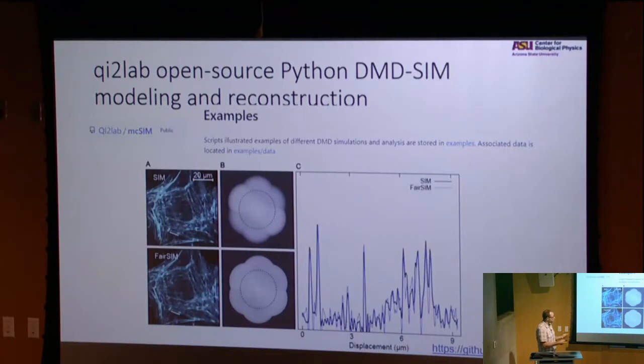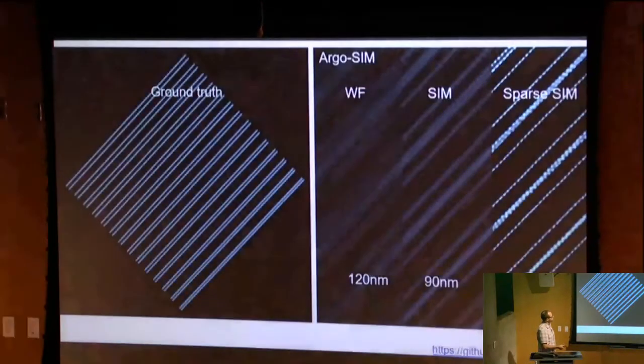If you're interested in this type of SIM, the super resolution SIM, we've compared it to other groups. It compares favorably. This is the exact same sample imaged with our instrument, compared with our algorithm versus another group's algorithm that doesn't know anything about our instrument. It just tries to estimate the parameters from the data. These are the resulting images, and these are the resulting reciprocal space. You can see there's a slight difference in the band re-weighting, but the actual line cut of the data that's taken here is almost identical. So we're pretty confident that this helps.